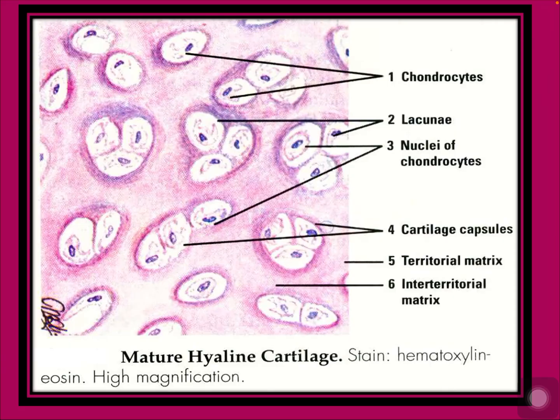So this is how the mature hyaline cartilage looks, and this is under high magnification. You can see the slides under high magnification in the labs also, so that you can appreciate the slides, but you should be careful when changing from low to high.